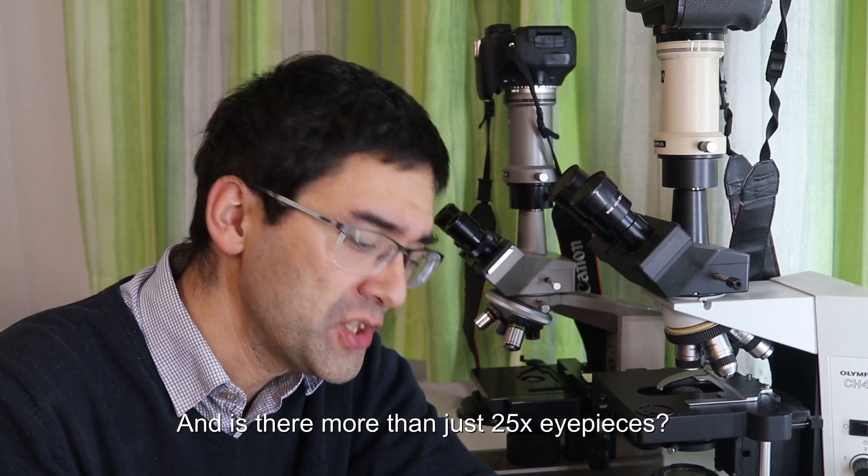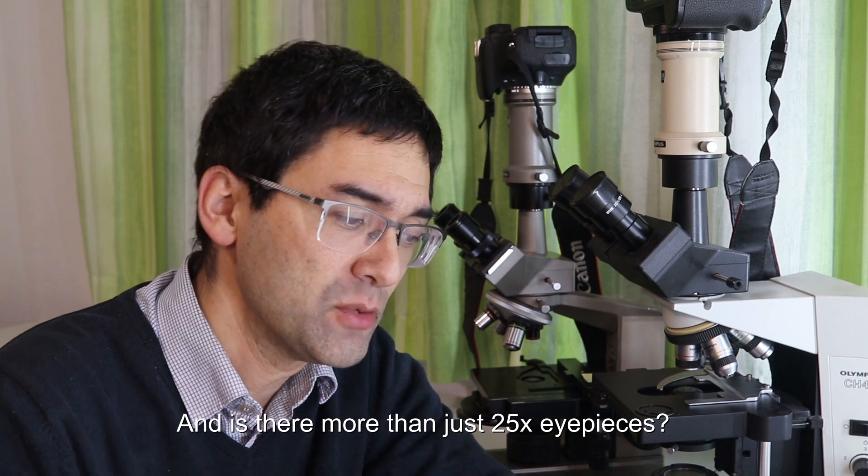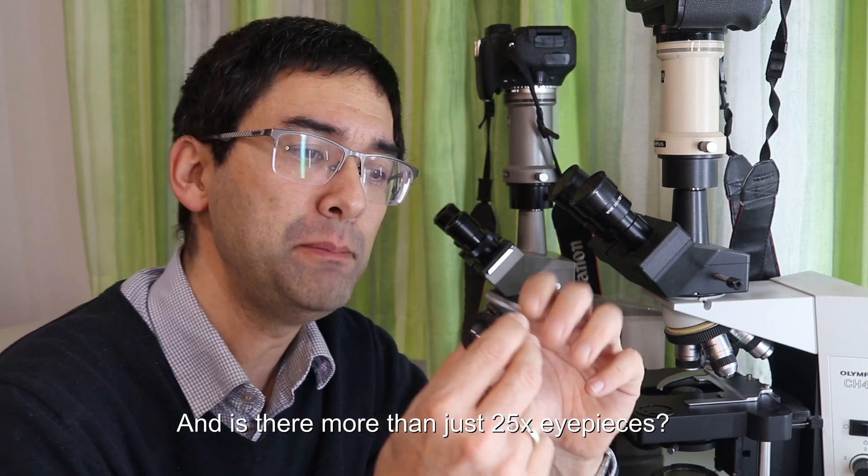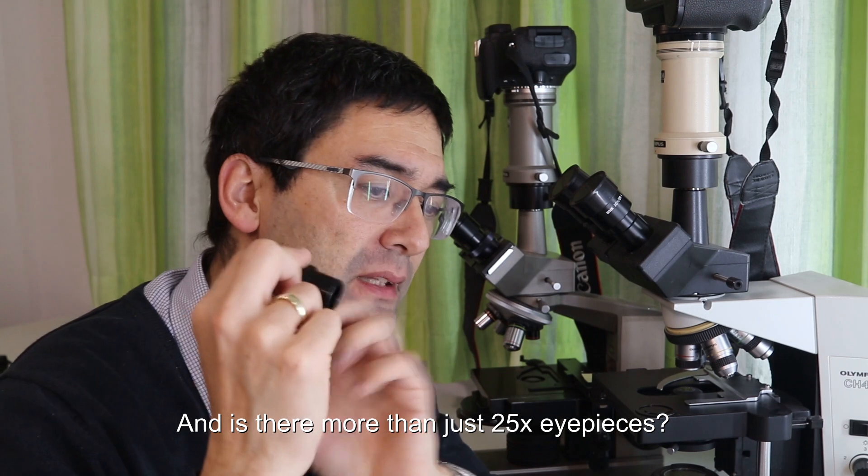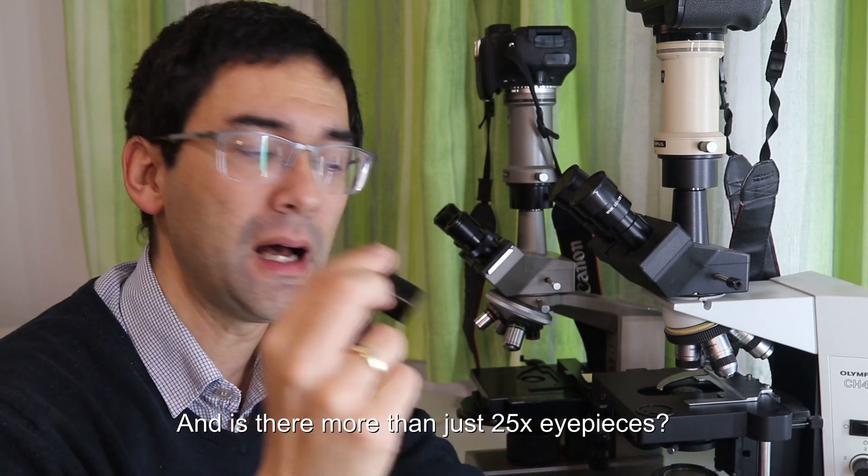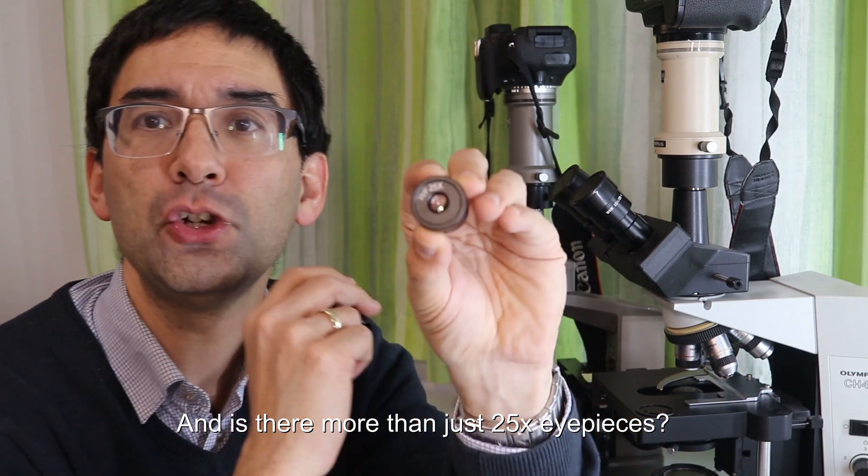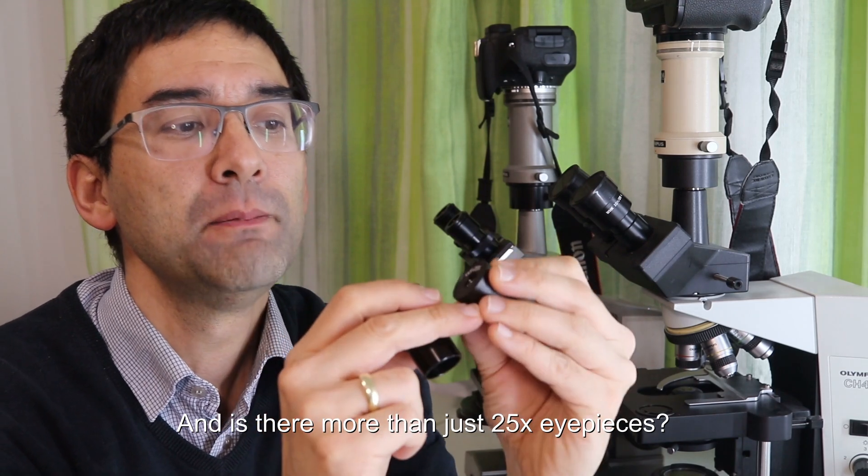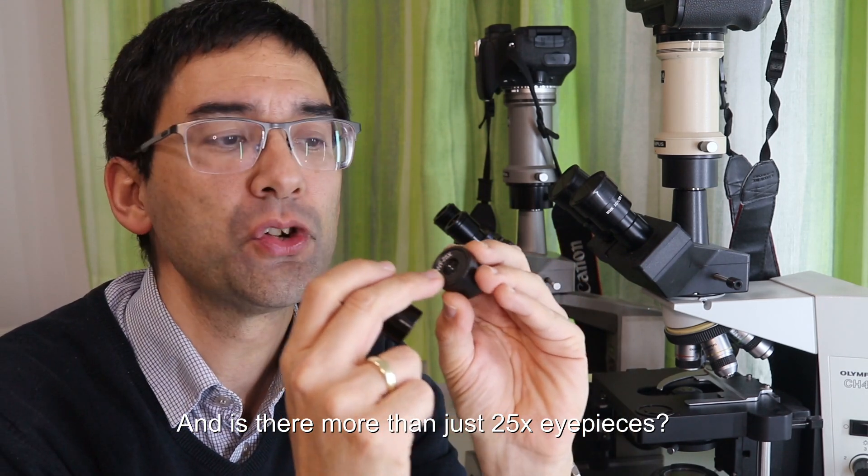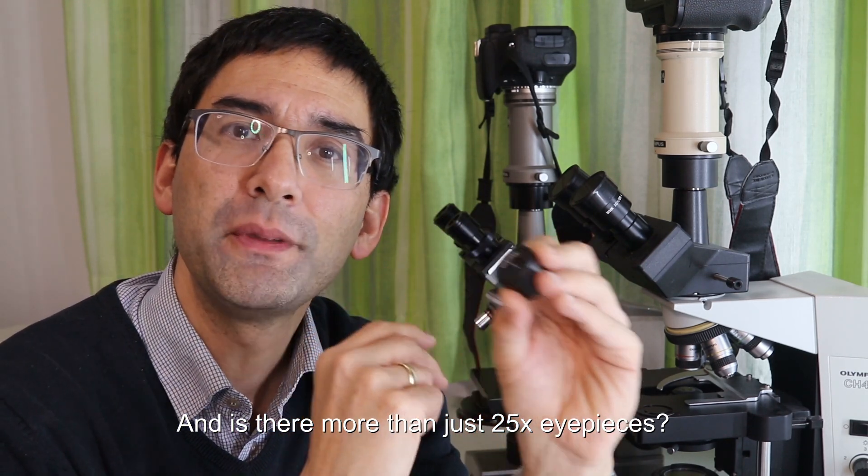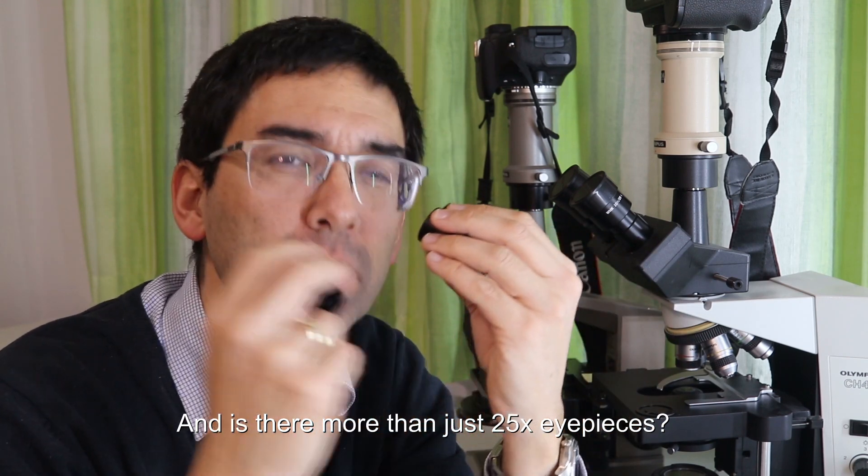So is there more than just 25x eyepieces? Most eyepieces, standard microscope eyepieces, magnify 10x. There are some eyepieces that also have a magnification of 25x. And you can see that the diameter is of course much smaller. And also something like the eye relief is smaller. And this means you have to really go close to your eye to still see a proper picture.